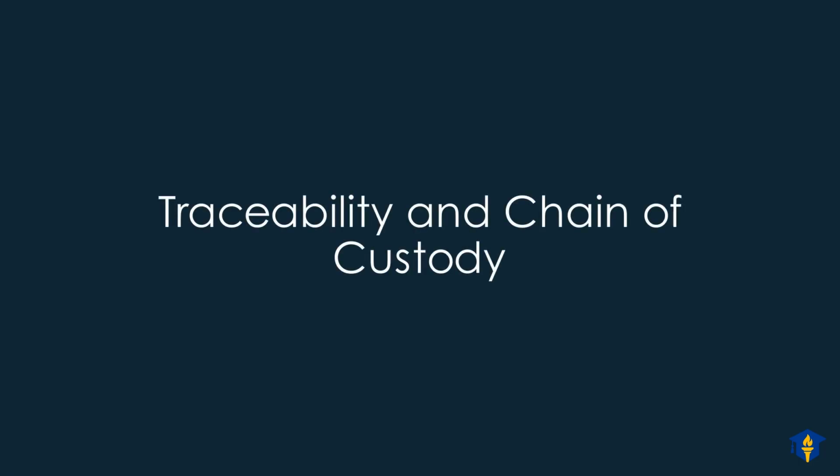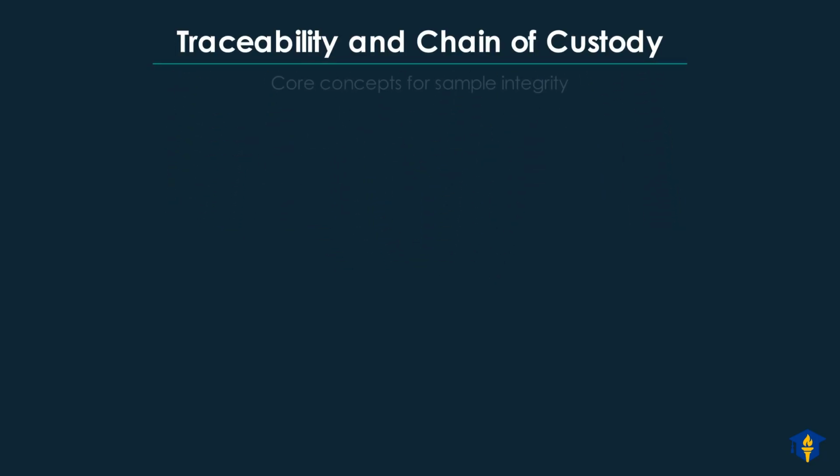Today, we will explore the essential concepts of traceability and chain of custody, vital for maintaining data integrity in laboratories. These core concepts are fundamental for ensuring the complete integrity and reliability of all samples throughout their life cycle.